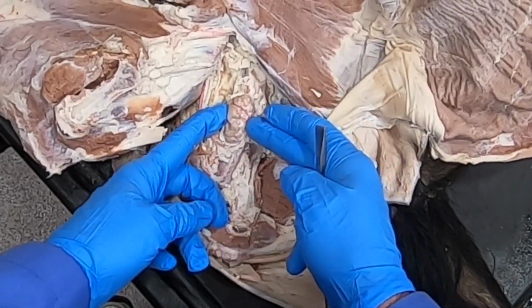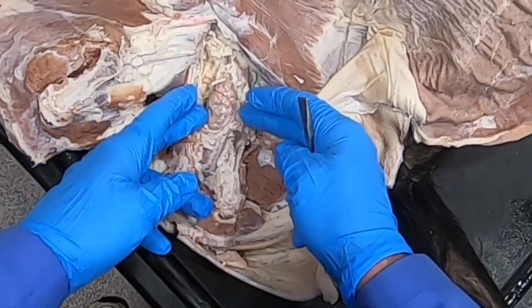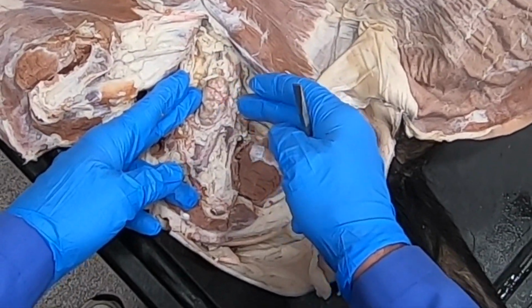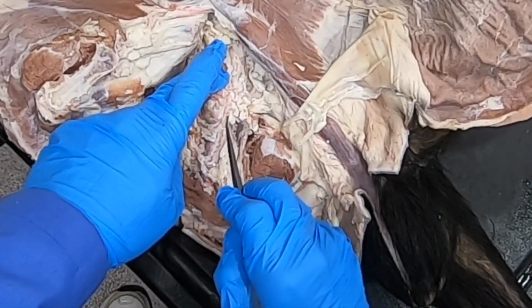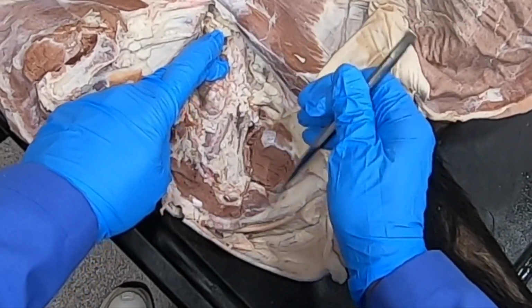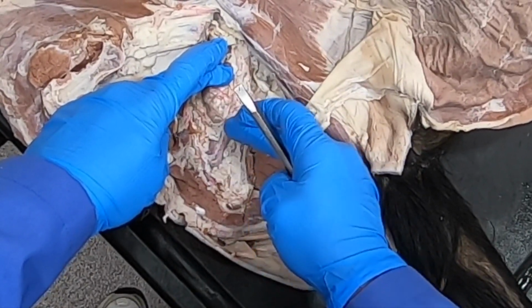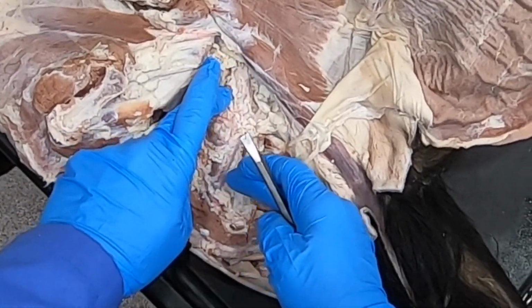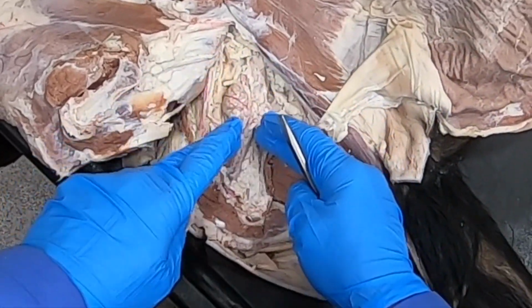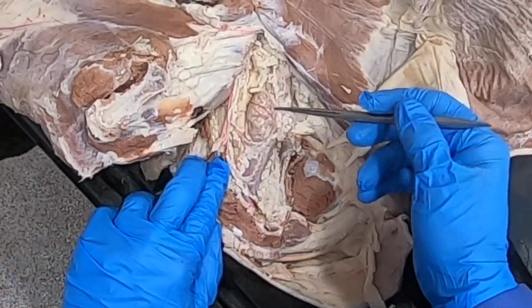It's more properly called vesicular gland in the ruminant because it is more gland-like rather than a vesicle. And the prostate is not very prominent on these guys because most of it is disseminate, which means it's within the wall of the pelvic urethra. Okay? And we're going to dissect all this out later. I just want to show you this very nice view here.